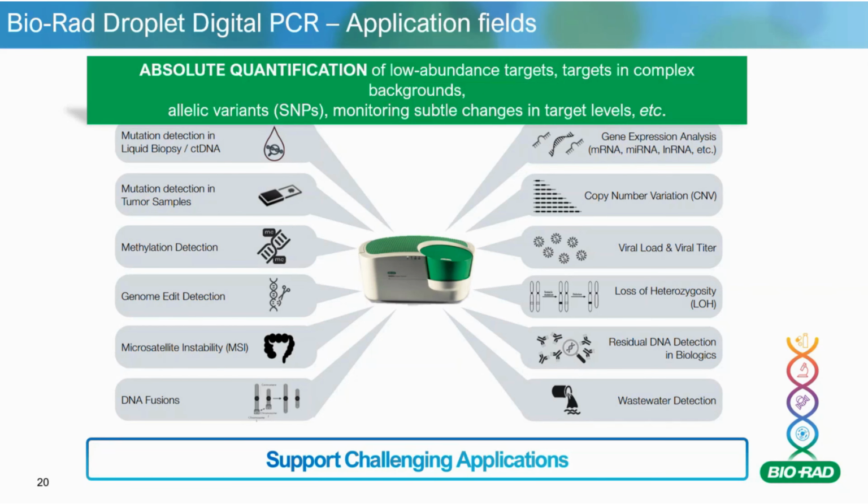Why would you do your NGS library prep in a ddPCR system over using a qPCR or endpoint PCR system? Well, generally when you run on a qPCR or an endpoint PCR system for library prep, what's going to happen? Enzymes are like everything, they're a bit lazy, and they're going to skew your data to your short reads or your short repeats, and your longer repeats are not going to get accurately copied, right? So your data is going to be all skewed to your short repeats.